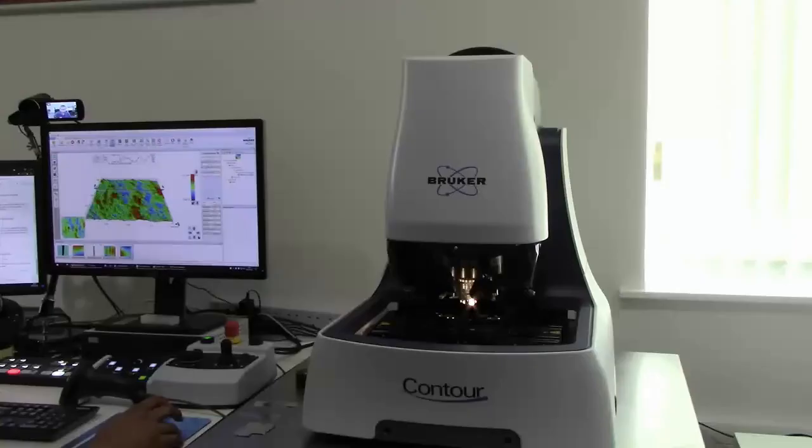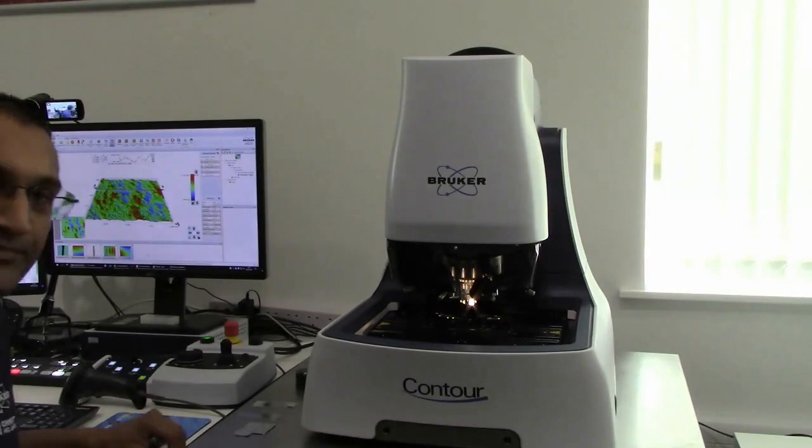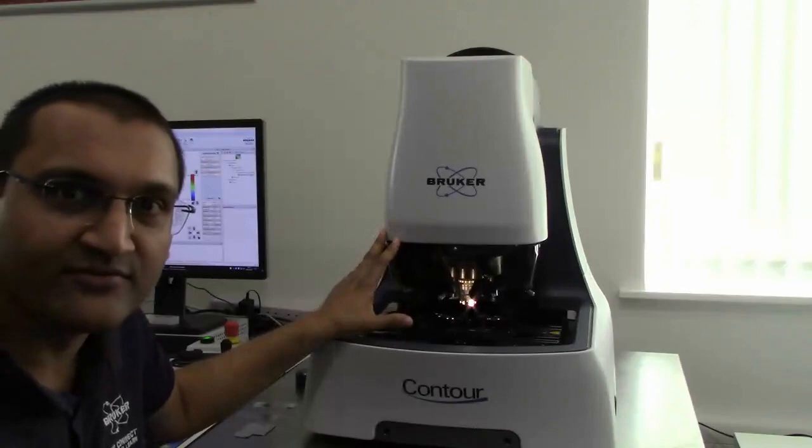So I'm going to show you very briefly how we do measurements on the Contour X500. You can see here, this is the instrument that I'm sitting next to. And this particular setup has an automated stage, automated turret, and a range of objectives. So we can do quite a lot with this system here.